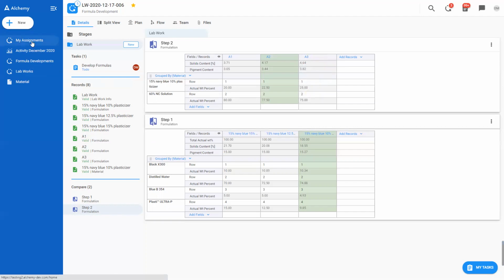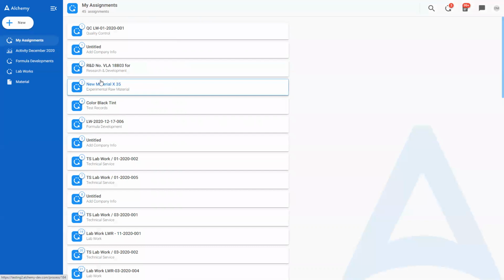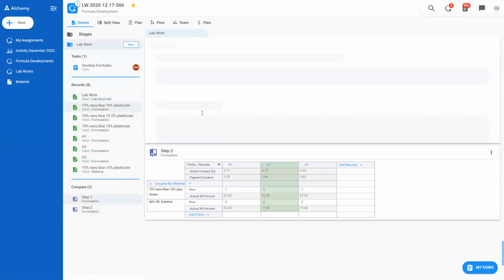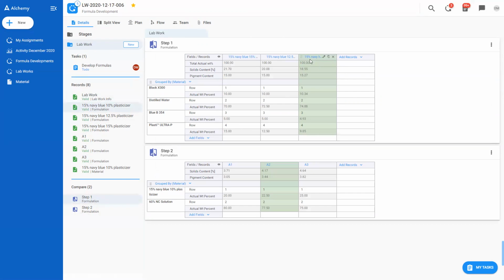So that, for example, when it is the next day, I just want to continue where I left off, but I forgot what was my train of thought. I could just open that project, see what was step one. So this was the best performing one, and then I used that one in this trial, and this one was the best performing one.